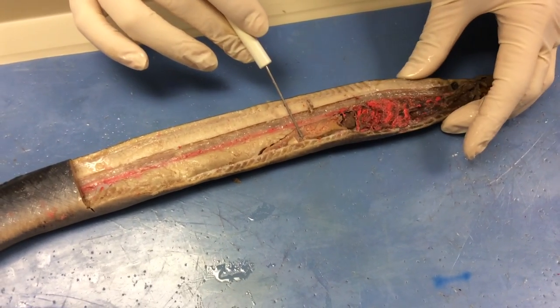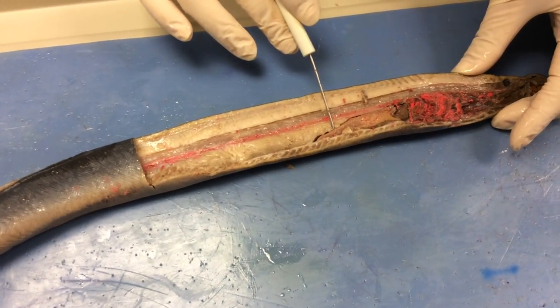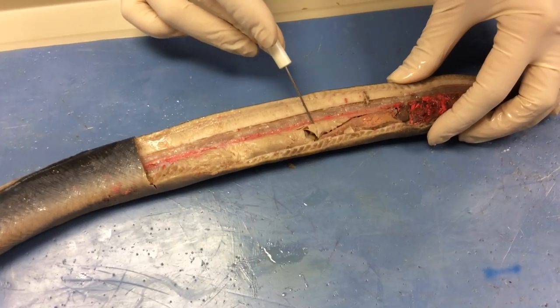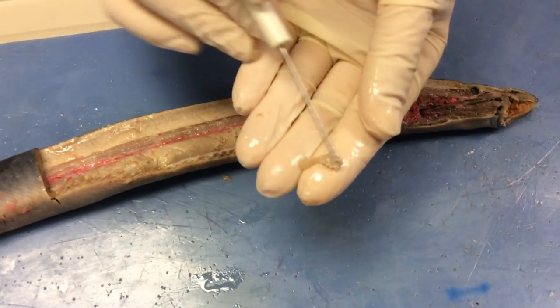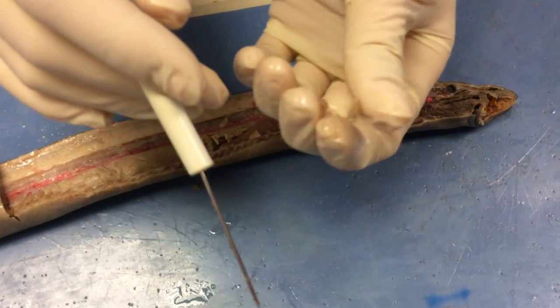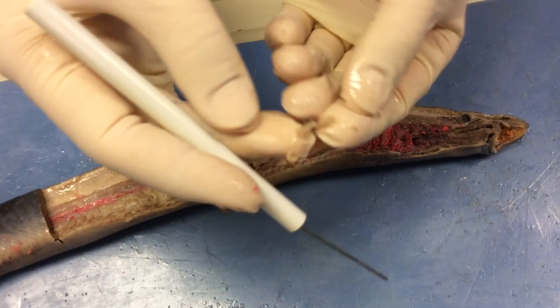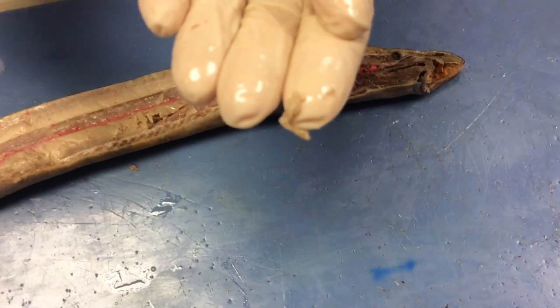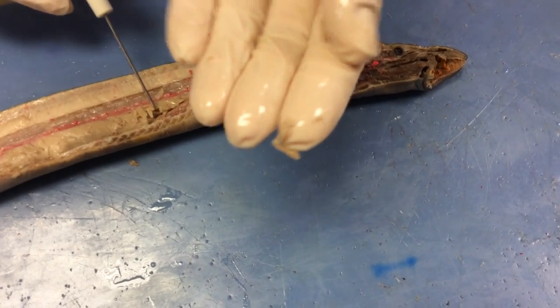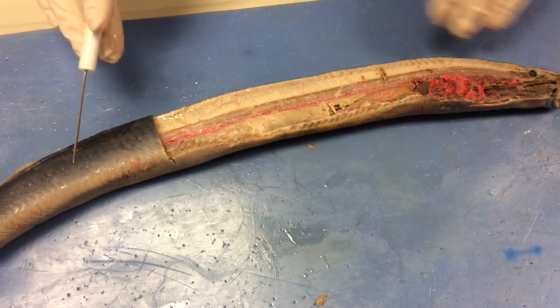And then just posterior to the liver is this long cream-colored structure. If you were to take a section of it out and squish it in your fingers a little bit, this one's not falling apart as well as I'd like it to, you'll notice that there are some circle-like or ball-like structures in there. Those are the eggs, so these are the gonads. All right? If you had a male, this would be sperm as opposed to the eggs, which would be female.